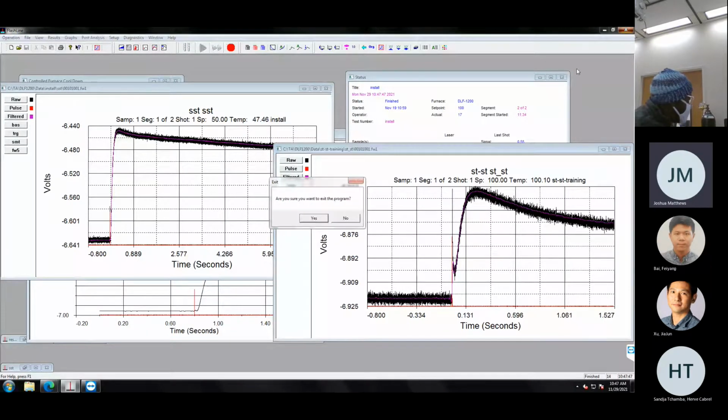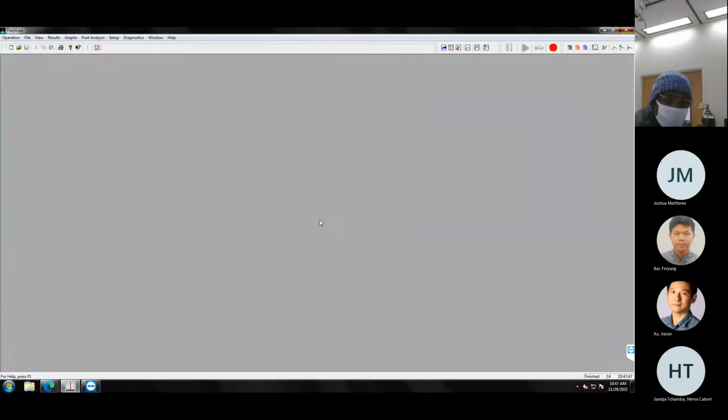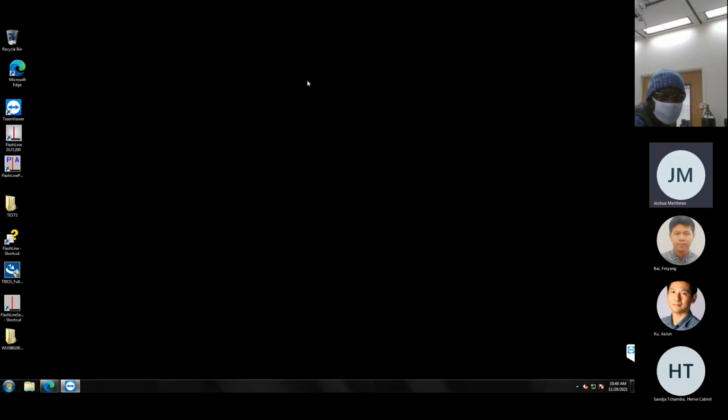You said the machine can take all the way to 4 samples, right? So is there any label there to know which sequence? I will show you that. When you set up the test, it'll show you 1 through 4, and you can set the different names for those samples. Yes. Okay. We open the software.